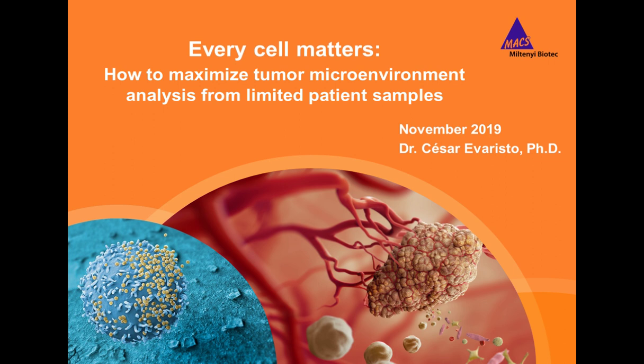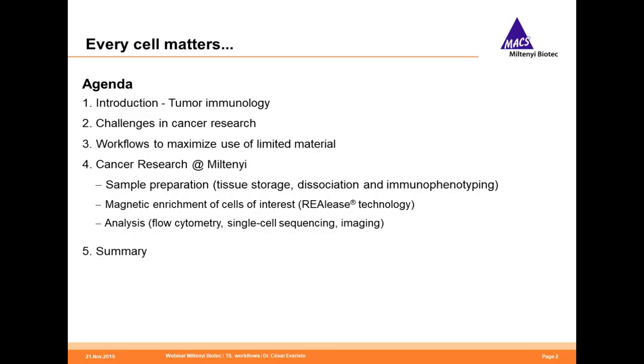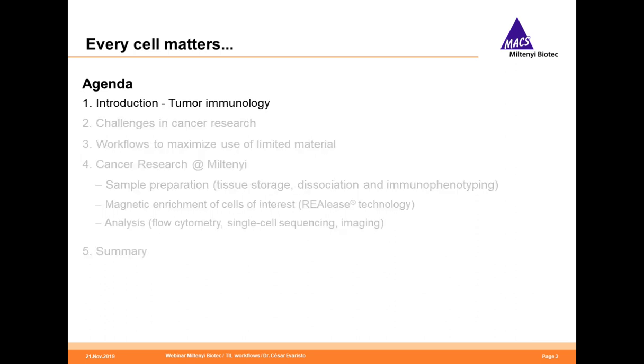Thank you for the introduction, Susie. I'd like to welcome you all to this webinar entitled Every Cell Matters, How to Maximize Tumor Microenvironment Analysis from Limited Patient Samples. I will start by giving a short introduction, followed by identifying some of the challenges faced when conducting cancer research and how we developed workflows to overcome those challenges. I will then zoom in on some of those workflows and detail some of the tools we use for sample preparation, magnetic enrichment, and analysis of the populations of interest.